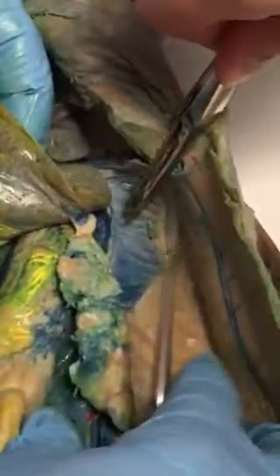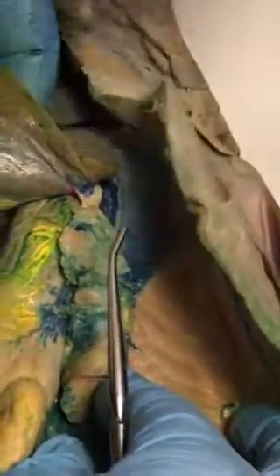I didn't get the cardinal ones on mine. The posterior cardinal sinuses are the pouches on either side of the liver, these blue pouches down here. Okay, those are the cardinal sinuses. The cardinal veins are in a pair by the dorsal aorta. Did you say along the liver? They're on both sides of the liver, like behind, under the liver. Maybe I can see it from this side.